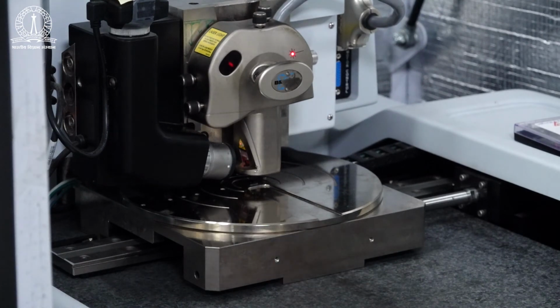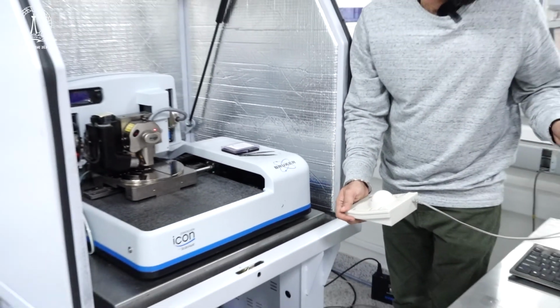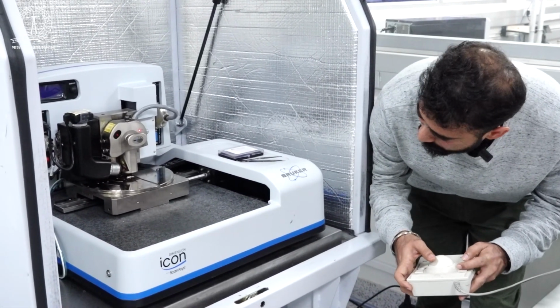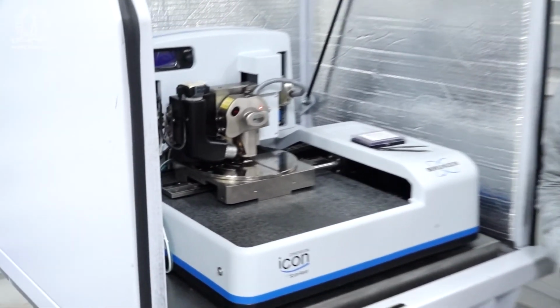Now for more finer, refined positioning or movement of the cantilever over the sample, we can use this joystick as well, or we can always use the software that's always there.